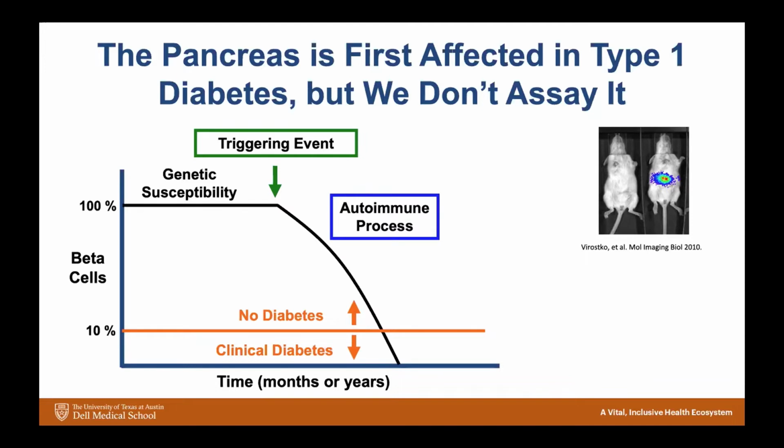So I thought this was really cool technology, right? It's pushing the limits of genetic engineering and instrumentation, where we're using these really powerful cameras that initially we actually had to pour liquid nitrogen over to get them sensitive enough to detect these small amounts of light. And we thought this was a pretty cool preclinical model. We crossed it with the NOD model of type 1 diabetes. We crossed it with the db/db and ob/ob models of type 2 diabetes.